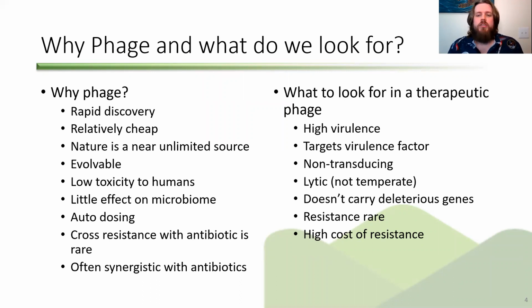For example, she looked at the bacteria that evolved resistant to phage and then evolving phage against those bacteria that became resistant and found that a lot of the time when the bacteria evolved around a phage, they lost something important that they needed for bacterial infections like LPS, and they were truncated, or attenuated rather, so they couldn't cause infection. But as bioinformaticians or data scientists, we're here, and this is where we're going to focus today.